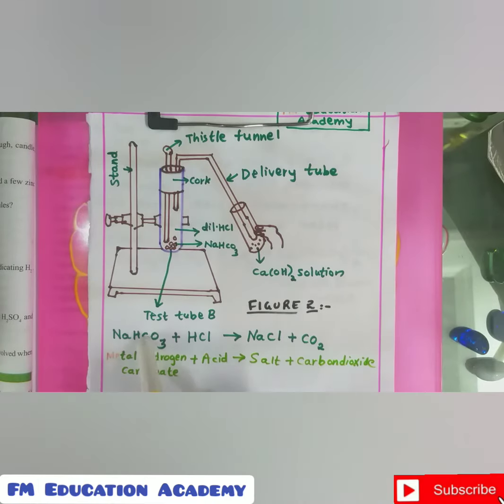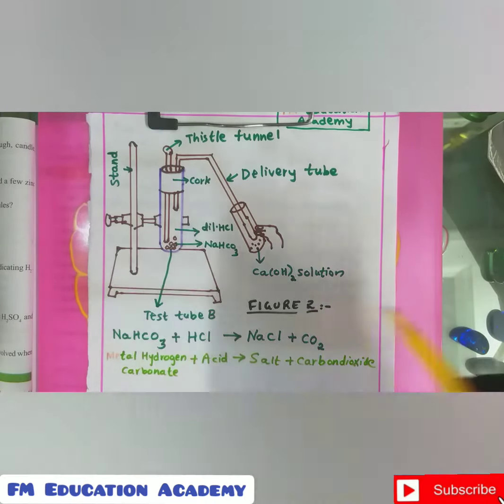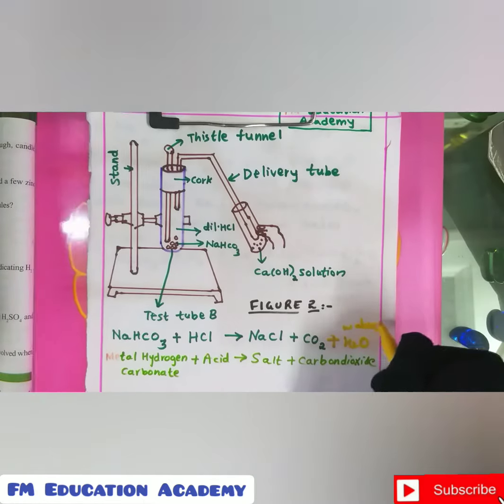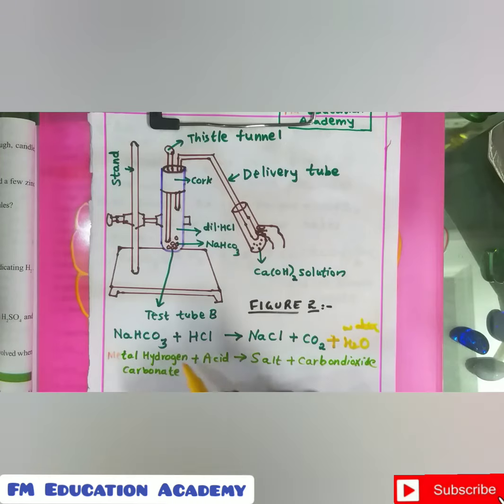Now, what will be our observation? Whenever sodium hydrogen carbonate reacts with HCl, what will happen? This will again split up. This is water. Whenever sodium hydrogen carbonate reacts with hydrochloric acid, this will be separated. That is, sodium reacts with chlorine to form sodium chloride. Then we have 2 hydrogens and 1 oxygen, it will form water. And then 1 carbon is left and 2 oxygens are left, it will form carbon dioxide.